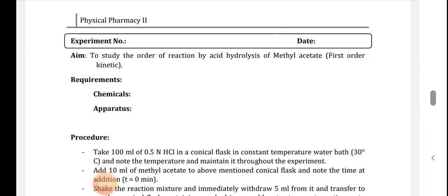Hello students, today we will perform the physical pharmacy practical which is related with chemical kinetics. The aim of your practical is to study the order of reaction by acid hydrolysis of methyl acetate. Acid hydrolysis of methyl acetate is one example of first order kinetics.